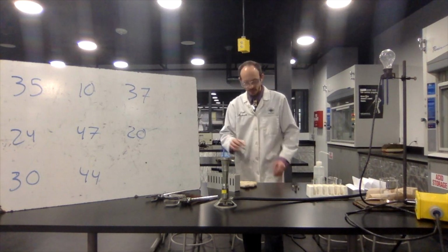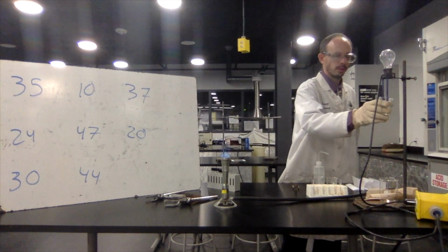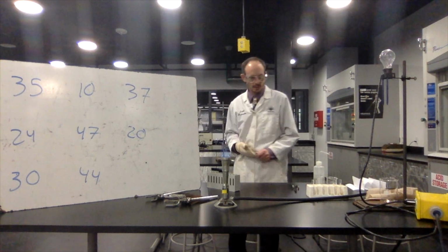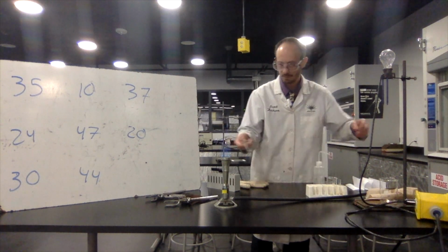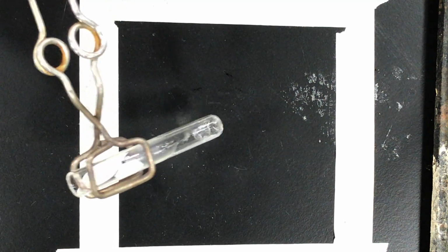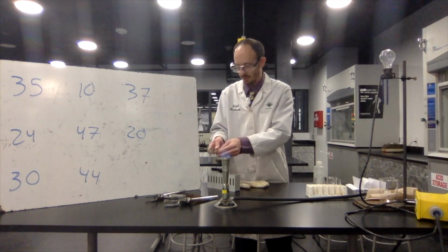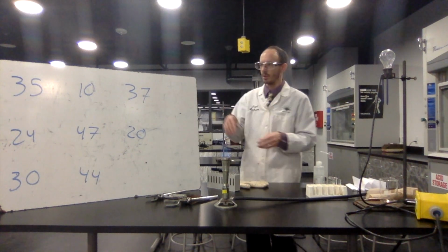All right? So now let's check its solubility. Or not solubility, let's check its electrical conductivity. I don't see anything. This can now go over there. And let's check its melting point. Okay. Ooh, this one has transitioned into a nice liquid. See, it's a liquid there. Okay. So I'm going to put that on here to cool. And say, done with that one. Next card.